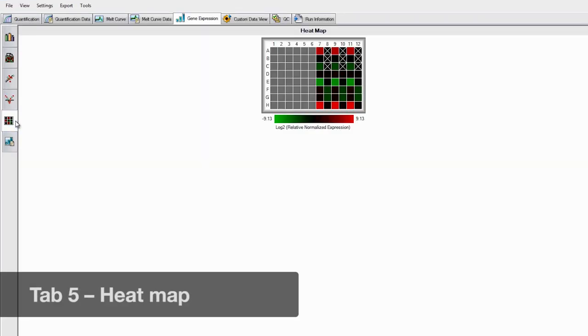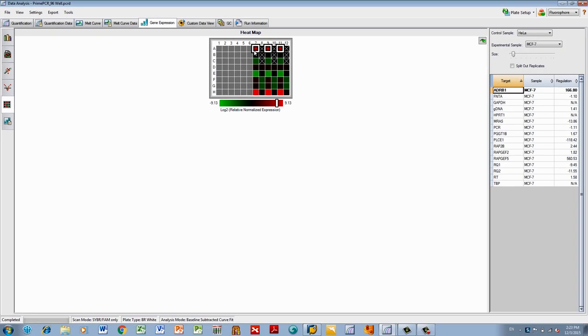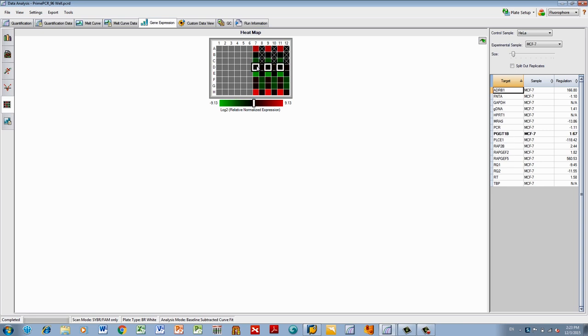The heat map presents a visualization of the regulation of relative normalized expression based on your particular plate setup. As with the clustergram, high expression change is in red, low expression change is in green, and no change in expression is in black. Samples with no value calculated are shown in black with an X.